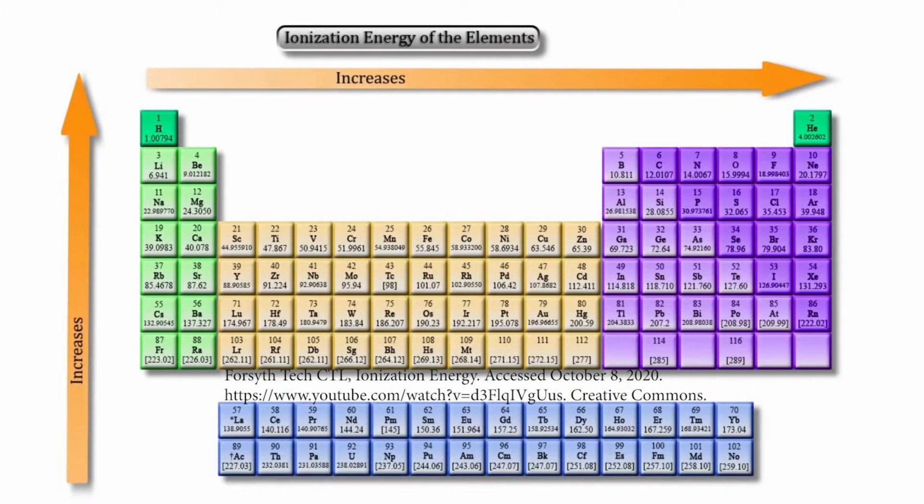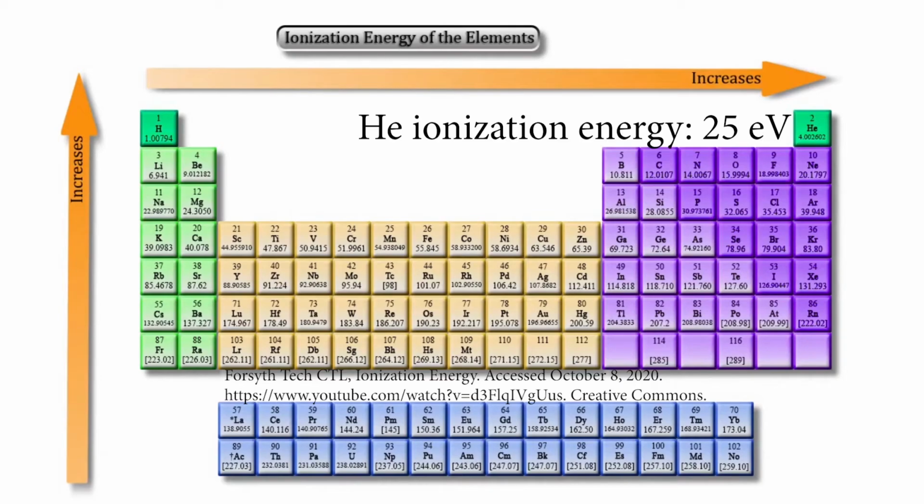Flashback once again to our general chemistry periodic table trends with ionization energy or ionization potential, and ask yourself, who has the highest ionization potential of anyone in the periodic table? Well, the answer is helium. So helium has such a high ionization potential that even though you're pumping energy into it with that corona discharge, that high voltage needle, it does not ionize. It takes on energy and goes to an excited state, but it does not ionize. We call this excited helium, but it's excited but not ionized. We call it metastable helium.